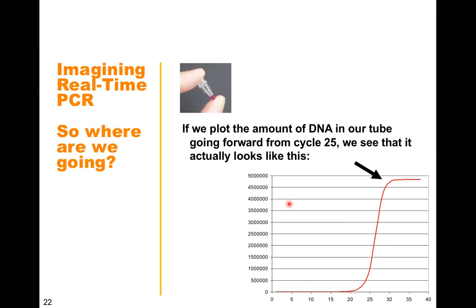Once it reaches a particular range, say here 45 lakhs, you can see that after cycle, say, 27 or 28, the graph is getting saturated. We have a steep increase followed by a straight line, or the plateau line. That is what happens.